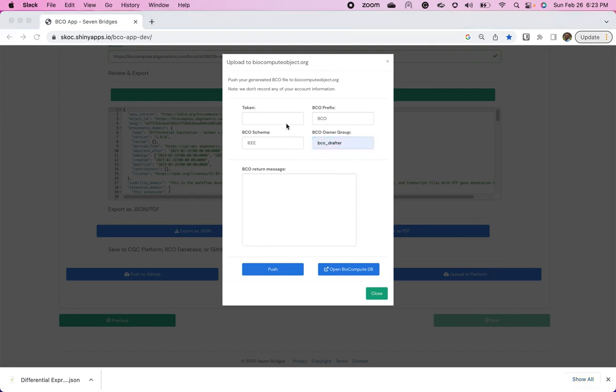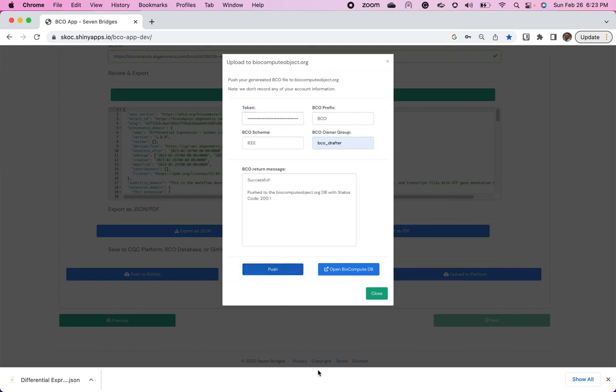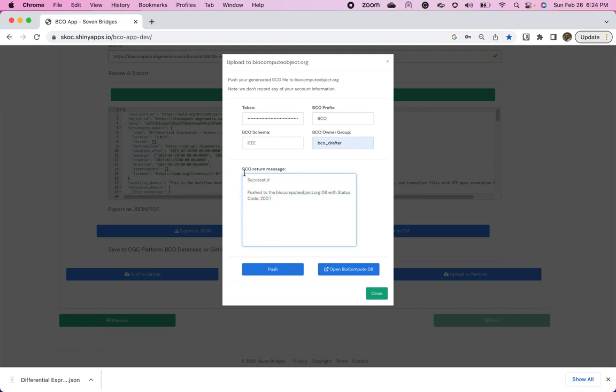Okay, after we've selected BCOdrafter, we're going to go ahead and put in our authentication token. We already have an account on the biocompute objects public website. So I'm just going to go ahead and put mine in, and we're going to push it. And you see you get a return message for successful. It's on the organization. So if you were to log in and look at the list of your BCOs, you'd see this as your latest push. And then that can then be reviewed by an agency such as the FDA, or maybe another collaborator that also uses the website.